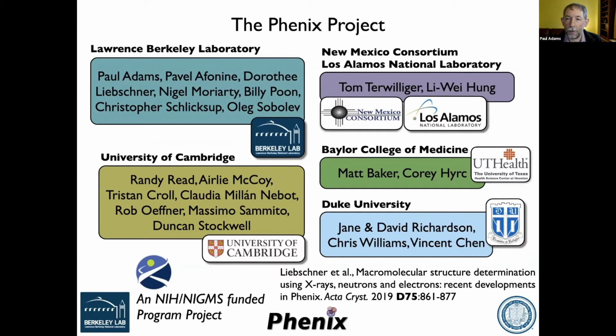Well, if we think about a ligand, for example, placing a ligand in a structure is not going to change the FSC particularly, right? Because it's a very small part of a big structure. So I wouldn't expect that to change much at all about anything, if that's the question. My question would be, can you really see the ligand in low resolution maps? I remember you were mentioning like 7 angstrom resolution maps. Can you really see ligands in those maps?